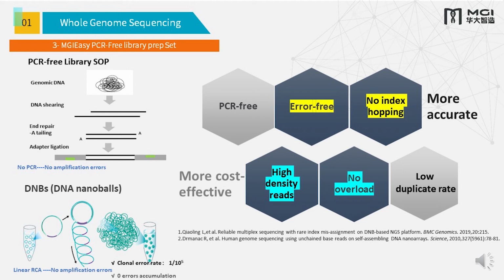After 11 years, the PCR-free library technology has changed a lot. Most of these changes come from finding a better enzyme for ligation, a better enzyme for fragmentation, and also for size selection. So now the PCR-free library kit from MGI recommends 1 microgram, but we still use 500 nanogram for some samples. Even for some meta samples, we use less than 200.